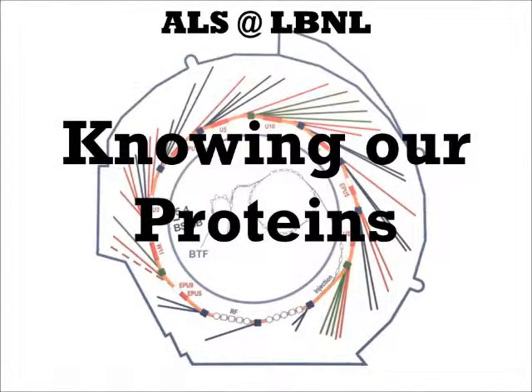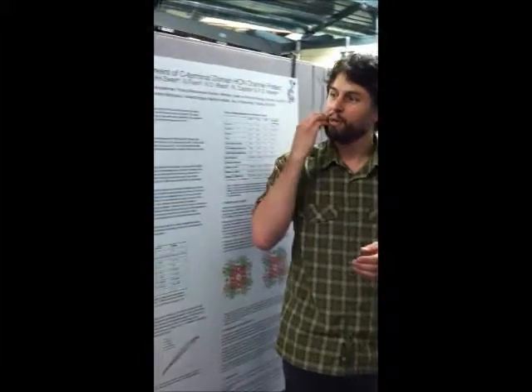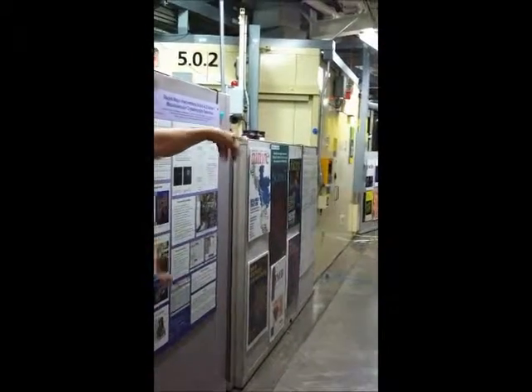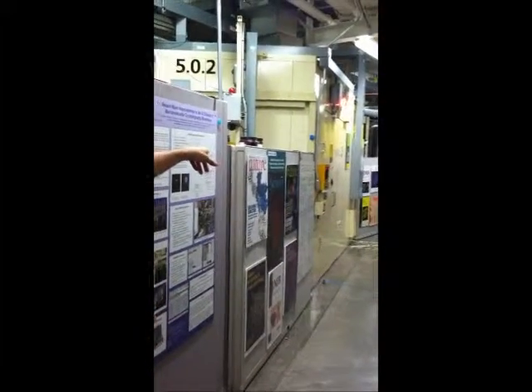Into there and block that reaction from happening. So the first step to understanding biology is understanding the structure of the protein. And these are protein crystallography beamlines. You'll notice this beamline looks a little different. It's actually in this room, and you can probably take a look at one of the ones around there.